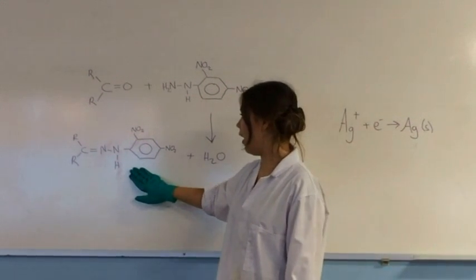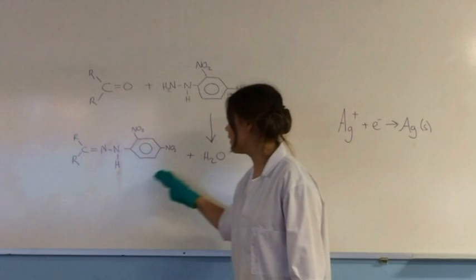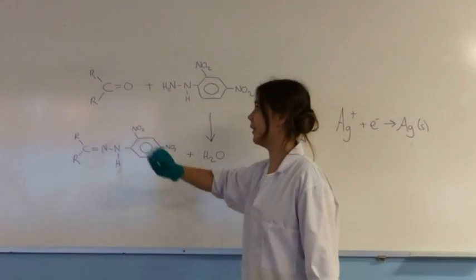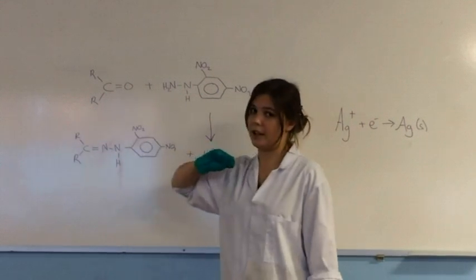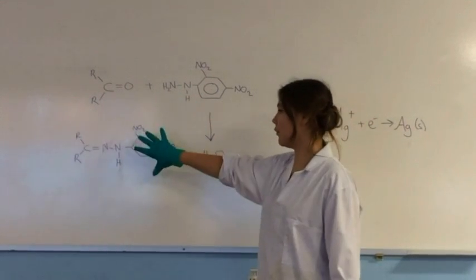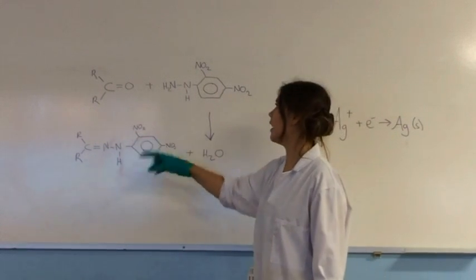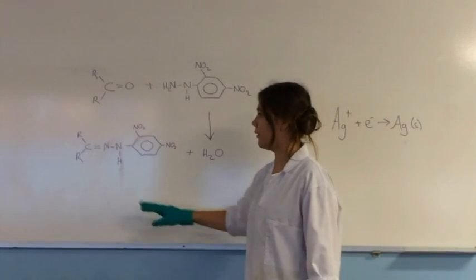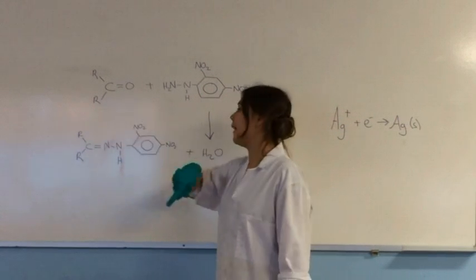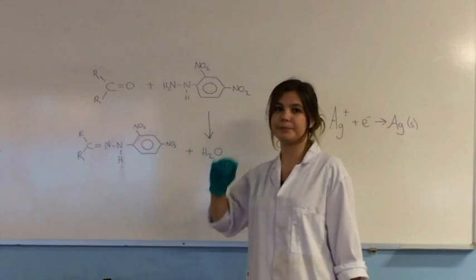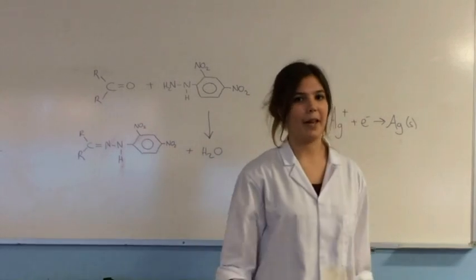And here we have the precipitate and this is going to be something, whatever aldehyde or ketone you had, something 2,4-dinitrophenylhydrazone, so slightly different name. So if this was propanal it would be propanal 2,4-dinitrophenylhydrazone and that is the precipitate that we have here.